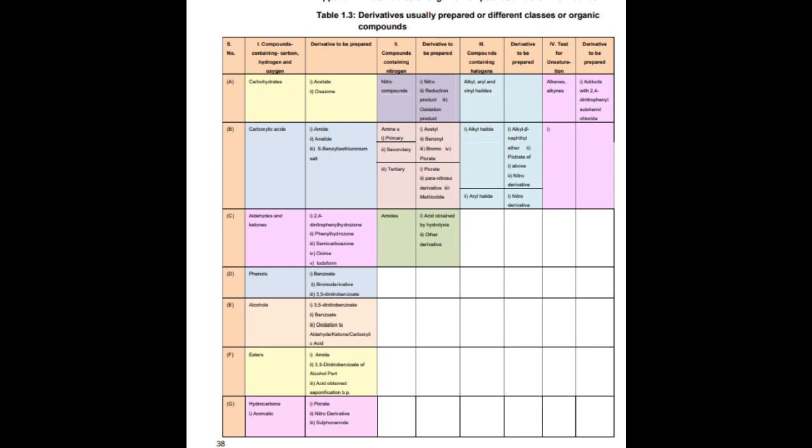2. Silver nitrate test. Procedure. Acidify the sodium extract, 1 ml, with dilute nitric acid, 2 to 3 ml. Boil the solution gently for 1 to 2 minutes to expel any hydrogen cyanide or hydrogen sulfide that may be present due to the presence of nitrogen or sulfur in the organic compound. Add silver nitrate solution, 0.5 ml, to the above solution.